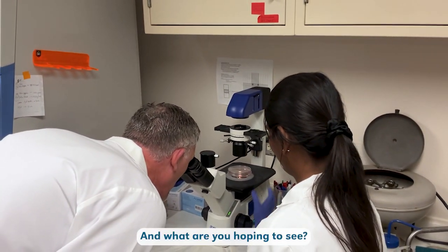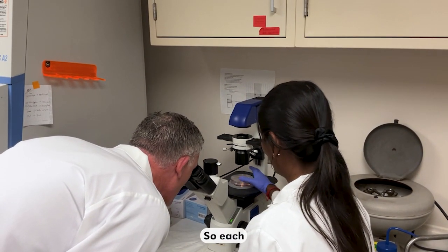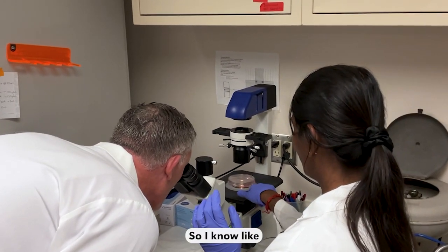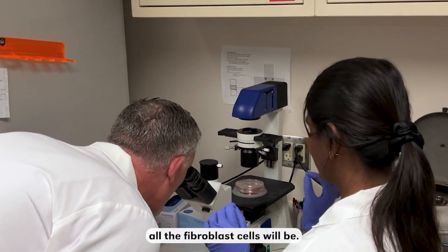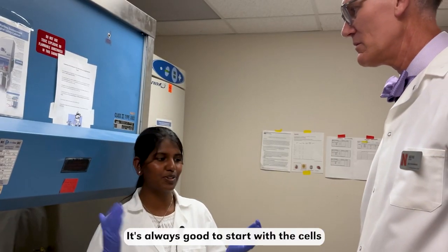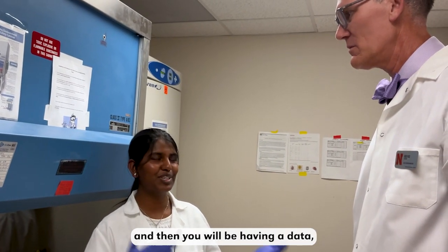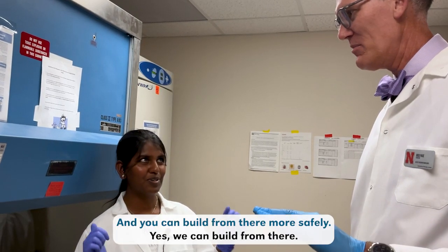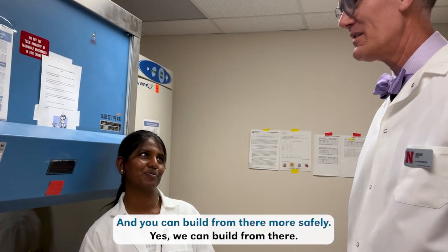And what are you hoping to see? So each cell will be having a different cell structure. Okay, so I know how the fibroblast cells will look. They will be like elongated cells. It's always good to start with the cells and then you will have data and then you will have an idea. And we can build from there safely.